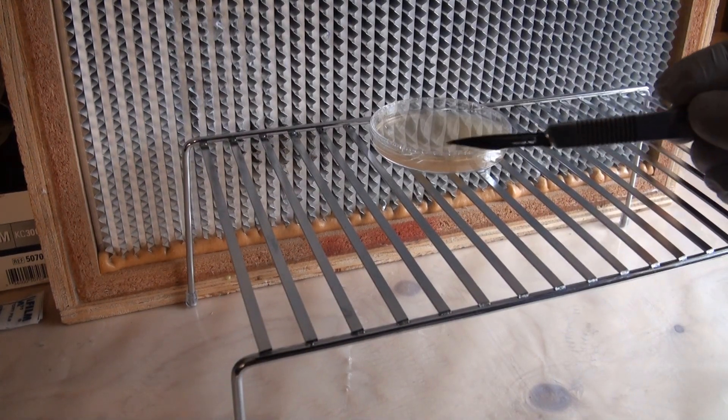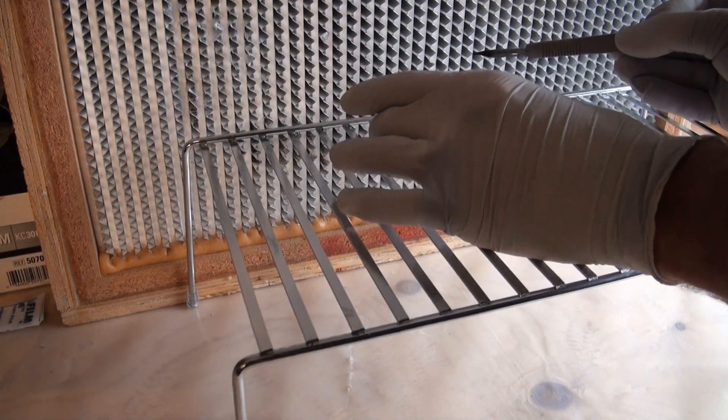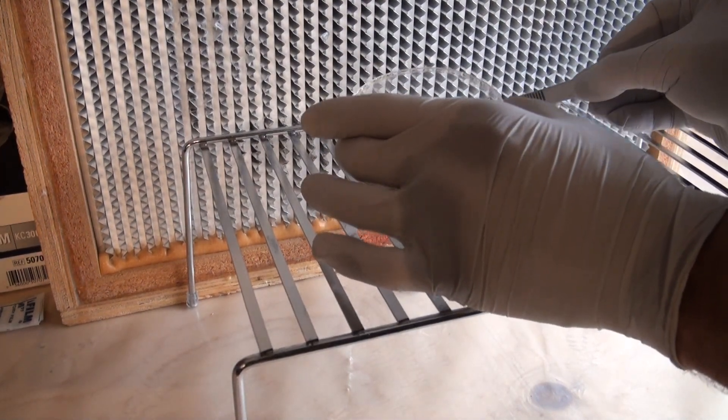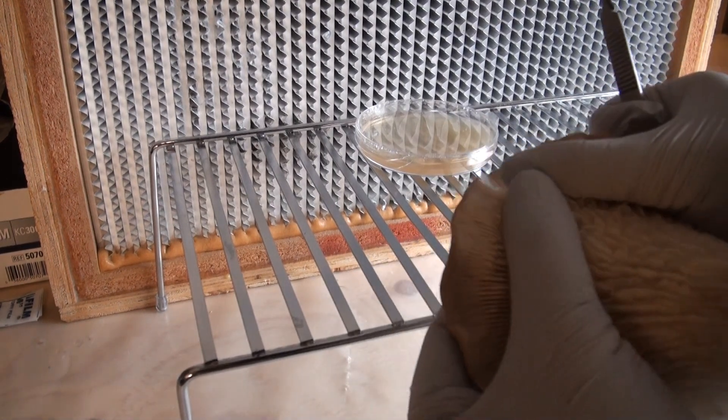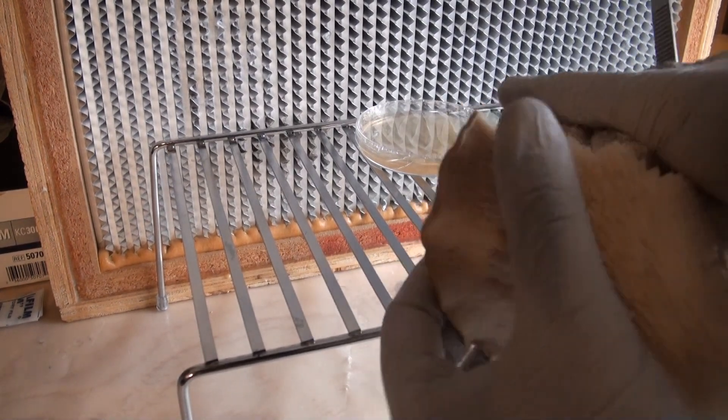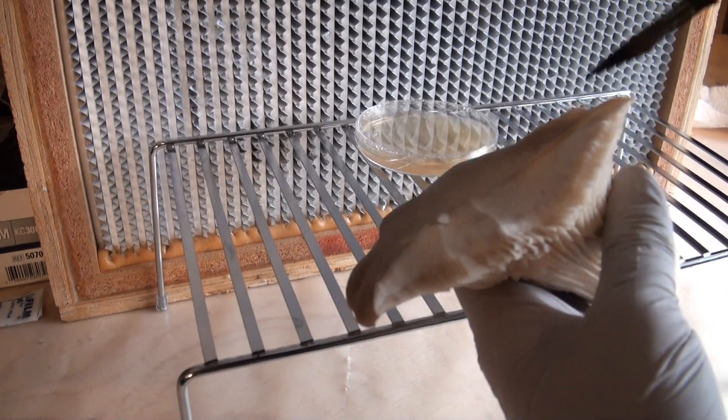So the next thing you want to do is take a scalpel that has been flame sterilized, go ahead and cool it in the dish. You can then take your mushroom fruit body and tear it open to reveal some of the inside of the fruit.